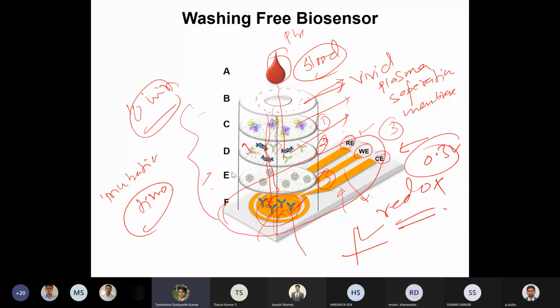Sir, do we remove all the papers after the test is completed? No. So it is kind of a very simple chip like this. So all the paper will be stacked step by step on the surface. Will not remove, just you will drop, and this part will be connected to your potentiostat, a small potentiostat. Then just drop and use. So you will get the data. So after use, you can throw this chip. So actually this kind of single use and throw.